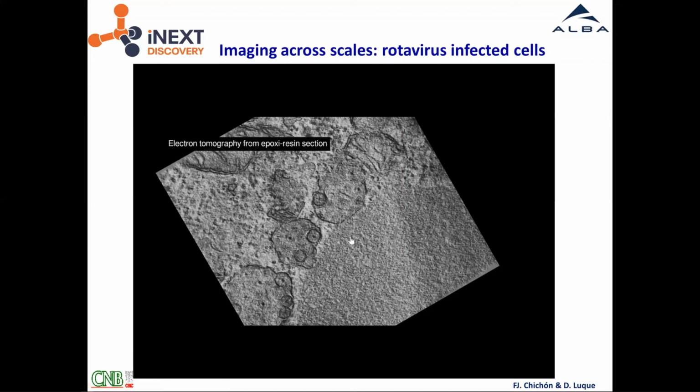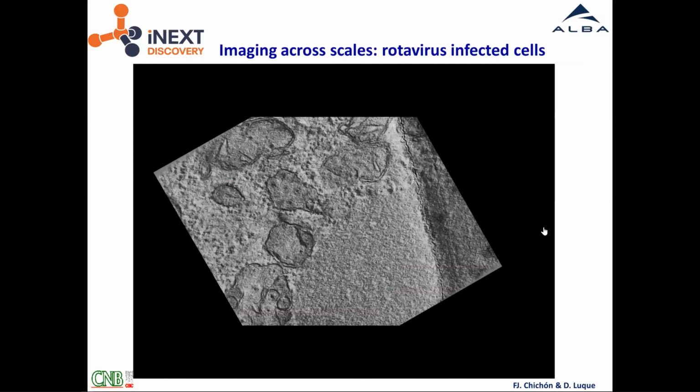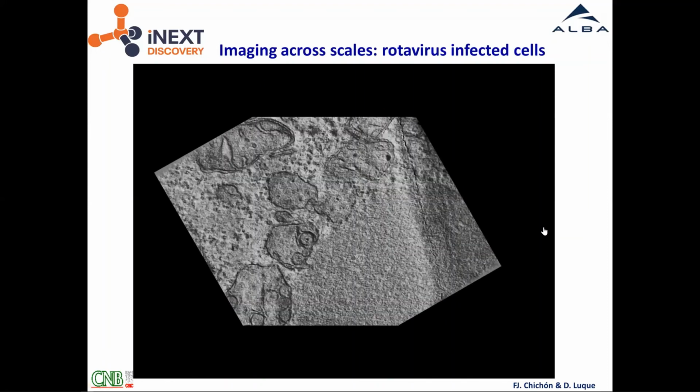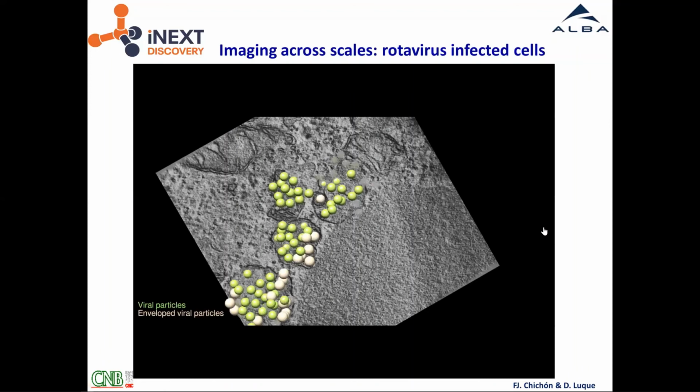So we are combining electron tomography from thin epoxy resin for higher resolution. And you will see that you have mature virions, which are enveloped viral particles.